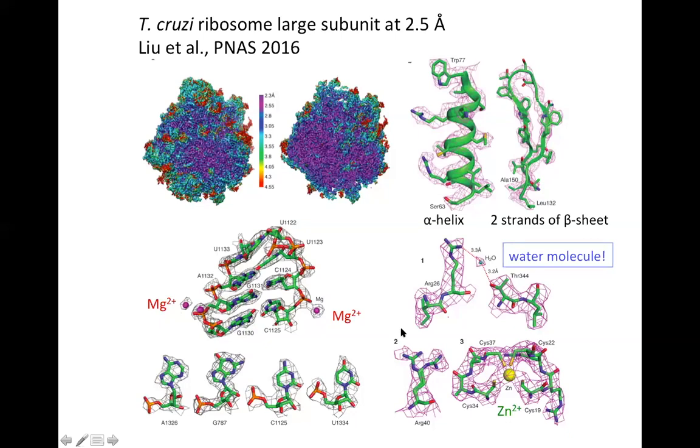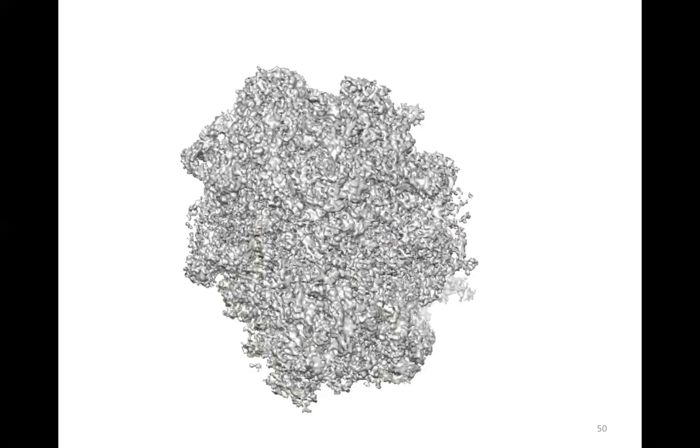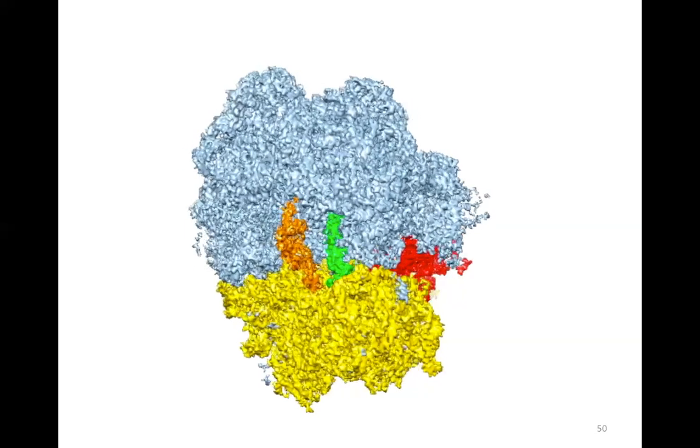And we see a protein secondary structure, and we can see a water molecule even. So after decades of development, to see a water molecule in a cryo-EM was an incredible and euphoric experience. I'll just show you this in a little bit more detail.